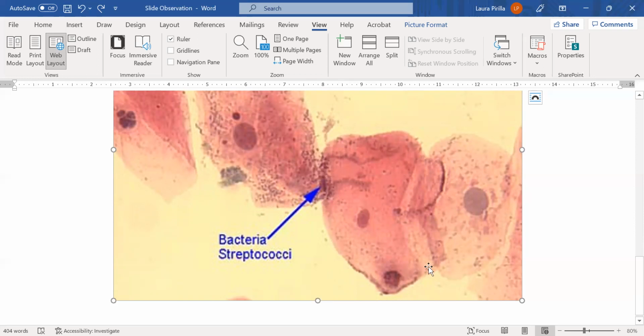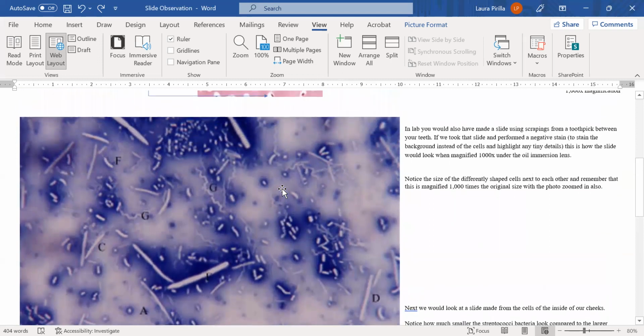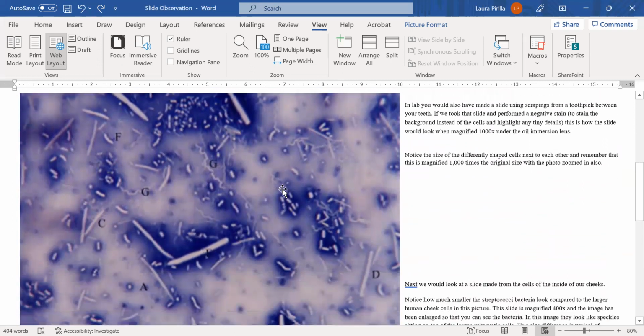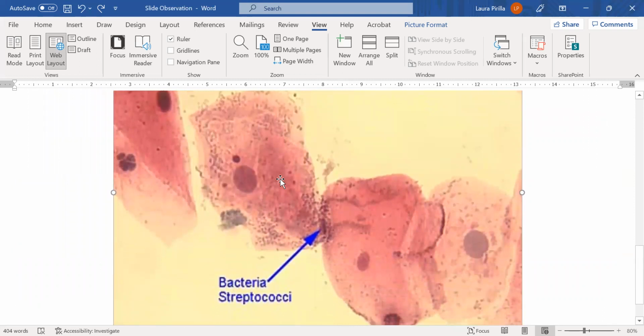This whole thing is probably one eukaryotic cell. All of these tiny little speckles in this area here and on some other spots all over the image, these tiny little speckles, those are individual prokaryotic bacteria like we blew up in this slide. So that's just the difference between 1000x and 400x in seeing them. But I mean, this is just so big by comparison.